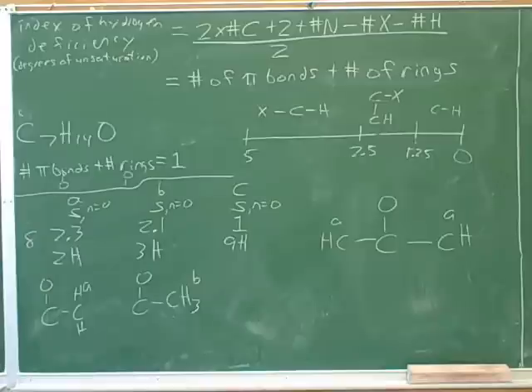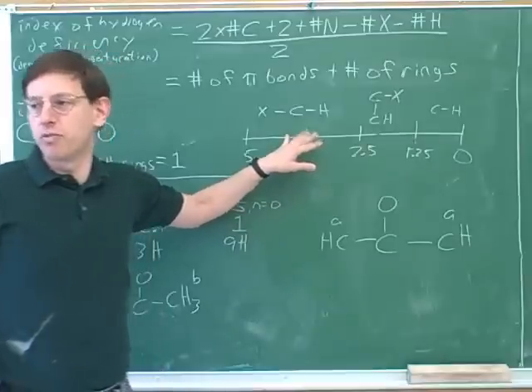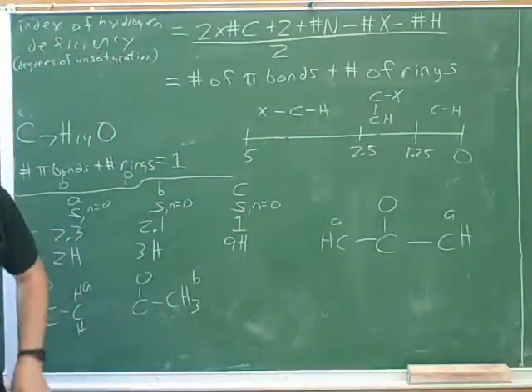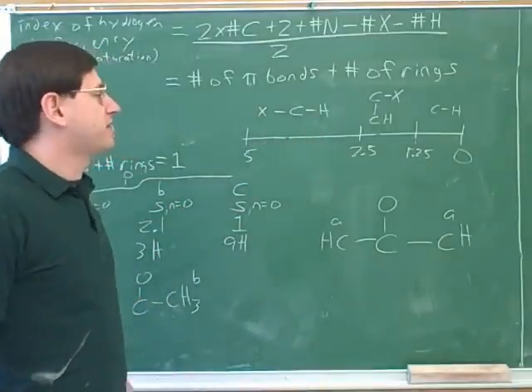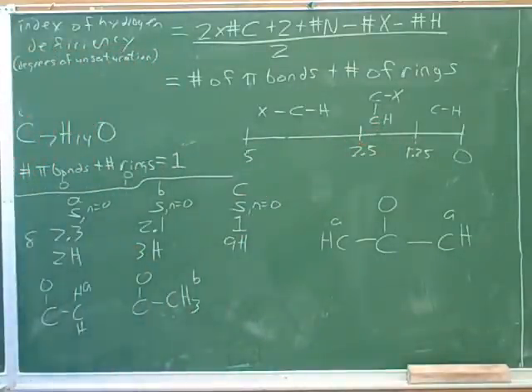So these are just rules of thumb. There are some exceptions to this. When in doubt, you can just look at the table to get the precise absorptions. It's always possible that something could slightly violate these bounds.